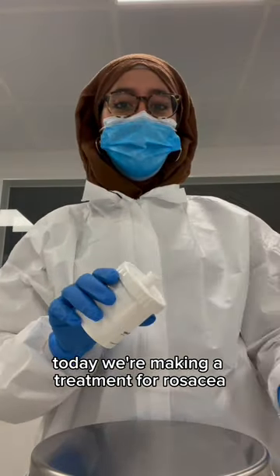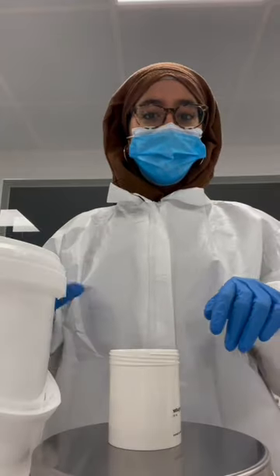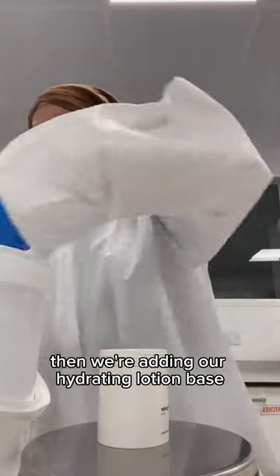Hi everyone, today we're making a treatment for rosacea. We start as usual by putting the spindle into the lid, then adding our hydrating lotion base into the pot.